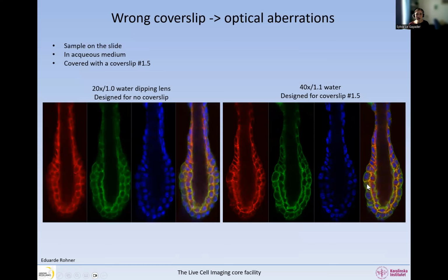And so clearly, because we have a lower contrast in these images, we definitely have a higher resolution when we have a higher contrast. So we'll see this next week. But you will only see the difference if you compare the images side by side. Otherwise, it's impossible to see that there is a problem with this image. It just looks a bit hazy, but you won't notice it.